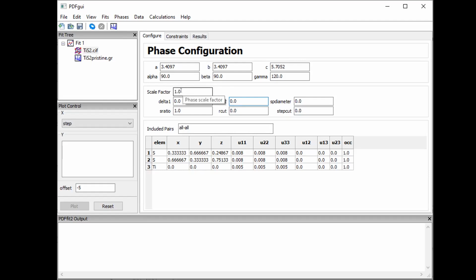this as like 100, and this is like 1, 2. This is 1, 1, 2, and this is something like 11, right? The 2 digits, same number, or if we have another UISO, then 22. If you have a third one, then it will be 33. This is my personal habit, but it helps me keep in mind the sequence of fitting and also the physical meaning of those parameters.